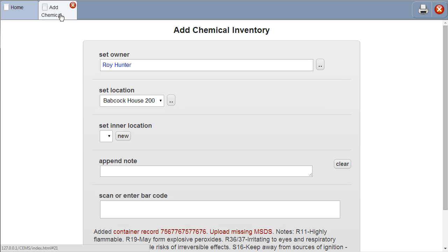This procedure of associating one record to another is used throughout UNHCEMS. It is powerful because it allows you to find another record in the system by filtering on any field in the record set. And if the record you are looking for does not exist, UNHCEMS will allow you to create it and select it on the fly.